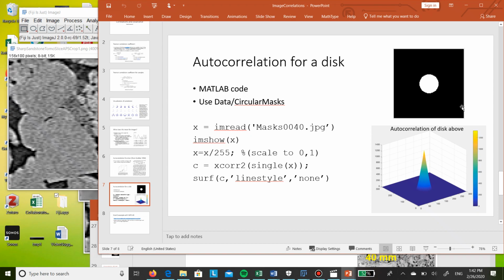But if you were trying to align things, then I would still say alignment would be best if image 0, 1 versus image 0, 2 on the second go, right? You would still have the best alignment once they're on top of each other, in terms of just having the highest correlation in that spot. Now, for your problem, you might want to look at the differences. Even if the X-ray numbers or CT numbers are changing ever so slightly, the differences with respect to the original image, once registered, might be helpful in distinguishing the phases.